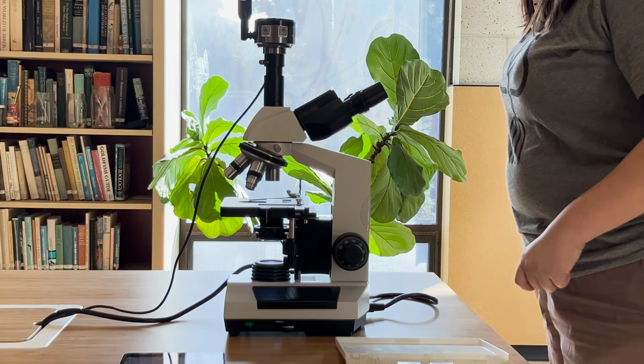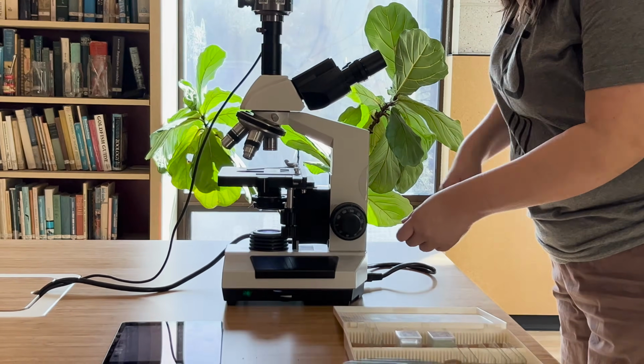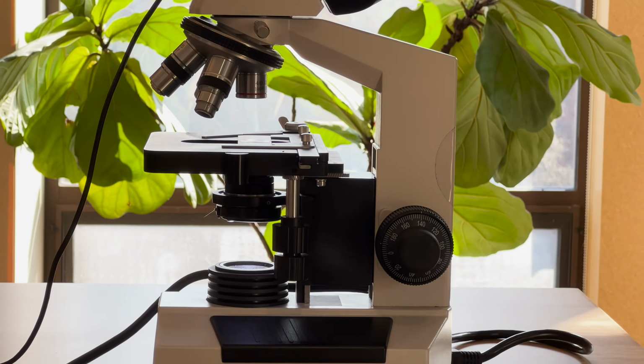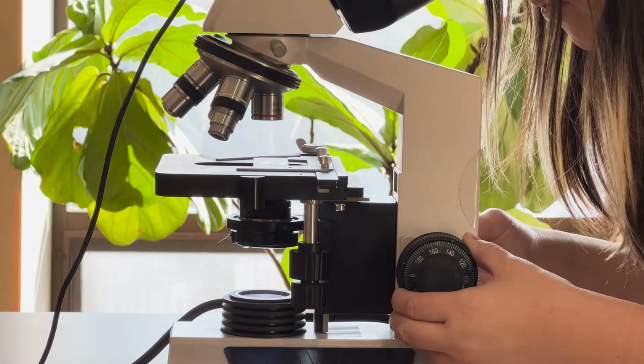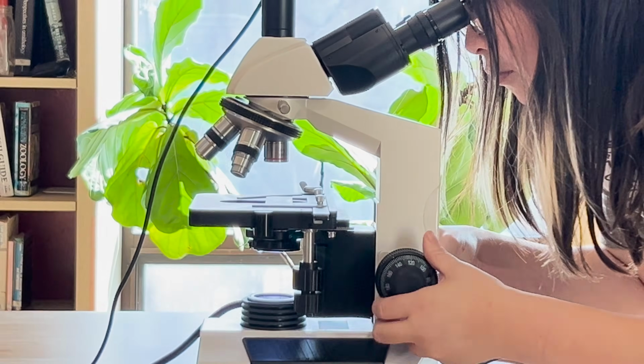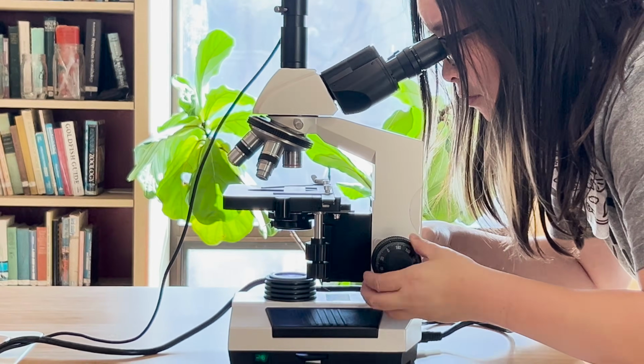Typically, we start at the lowest objective, 4x. When you place your sample, you will orient the stage so that the light is shining through the cover slip. Use the coarse focus to bring in a rough focus. Then the fine focus is adjusted to further clarify the image.